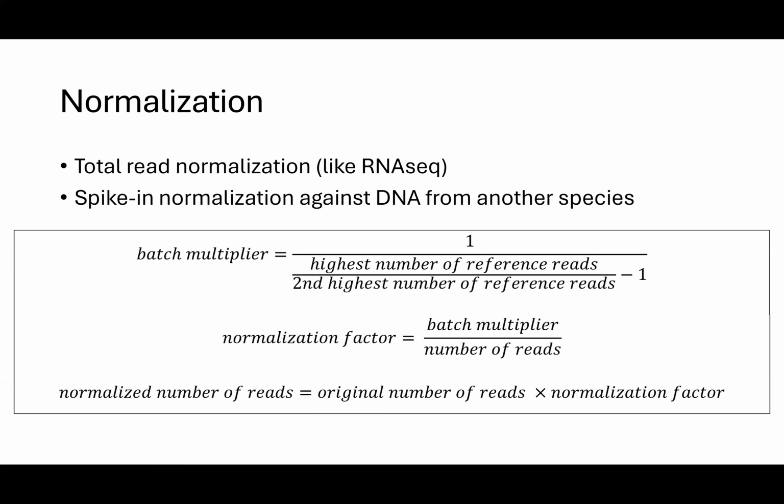The ideal situation is that you isolate cells or nuclei, with the same number of cells or nuclei, which can be hard to generate. You add the spike-in control, the same amount of DNA. You usually want that to be about 1% of your total sequencing reads, but that can take some troubleshooting because you probably don't know how many sequencing reads you're going to get, especially for a new target. A lot of the kits come with some guidance, especially for the K4 trimethyl, but if you're doing a transcription factor that no one's done CUT&RUN on before, you just have to guess and hope that you're right.